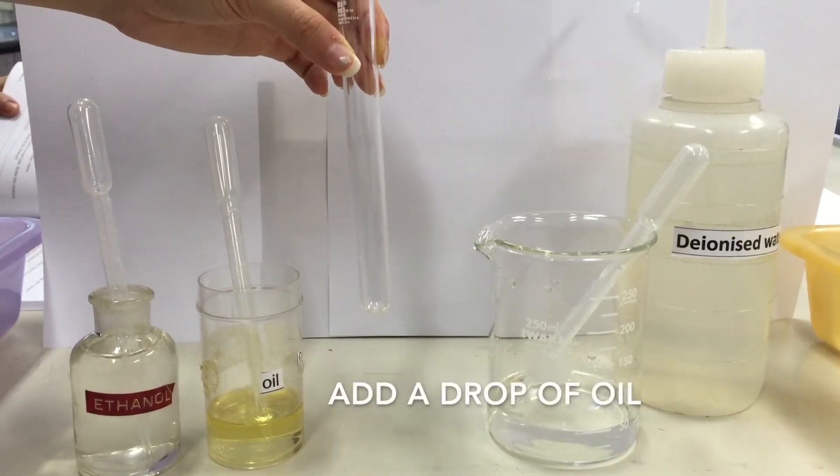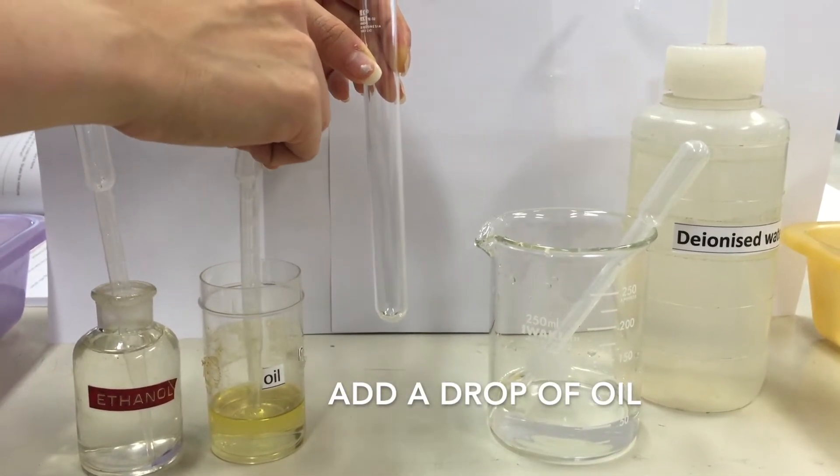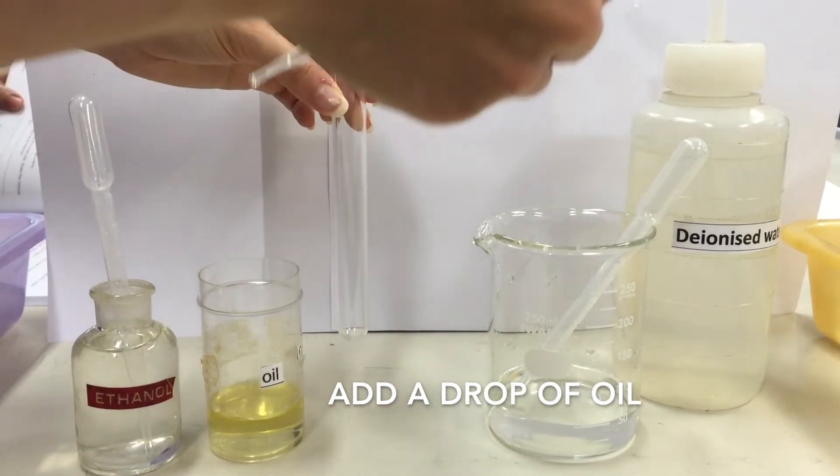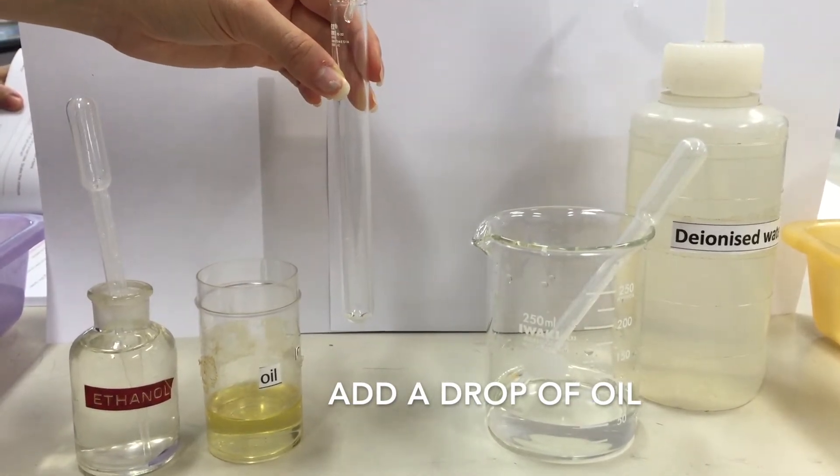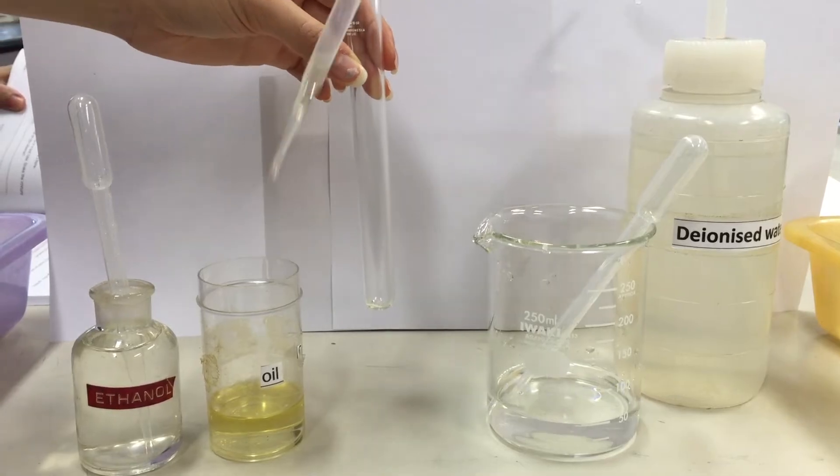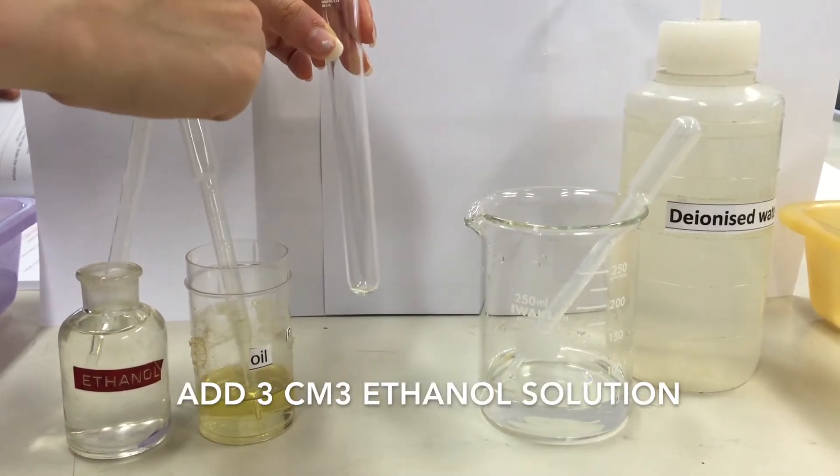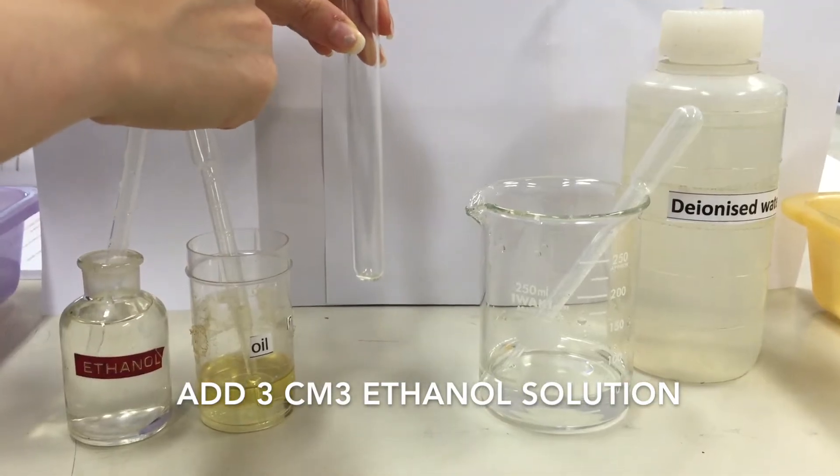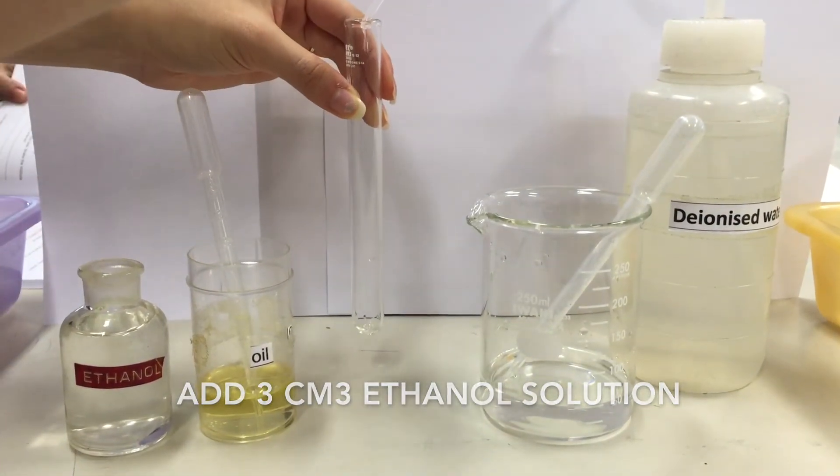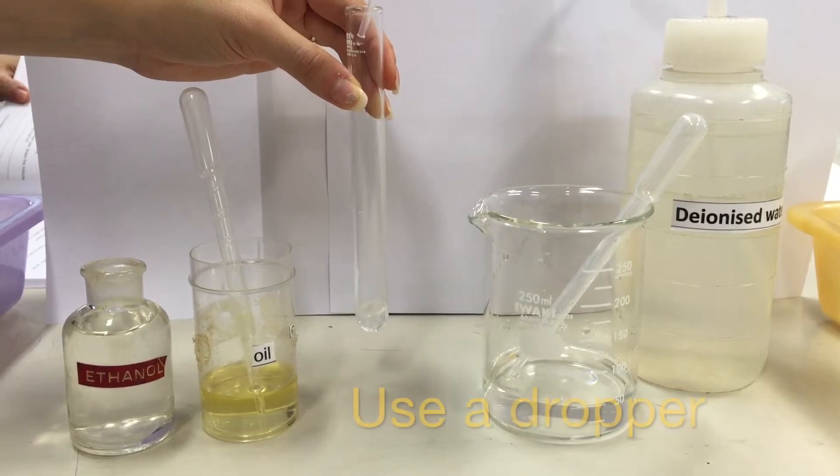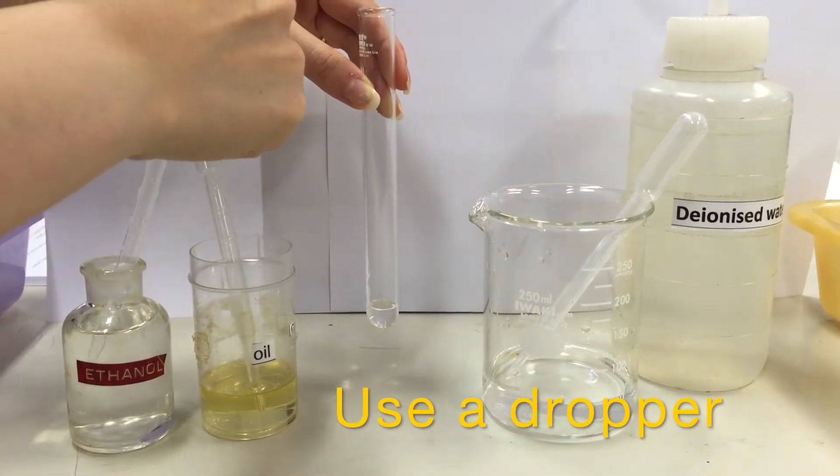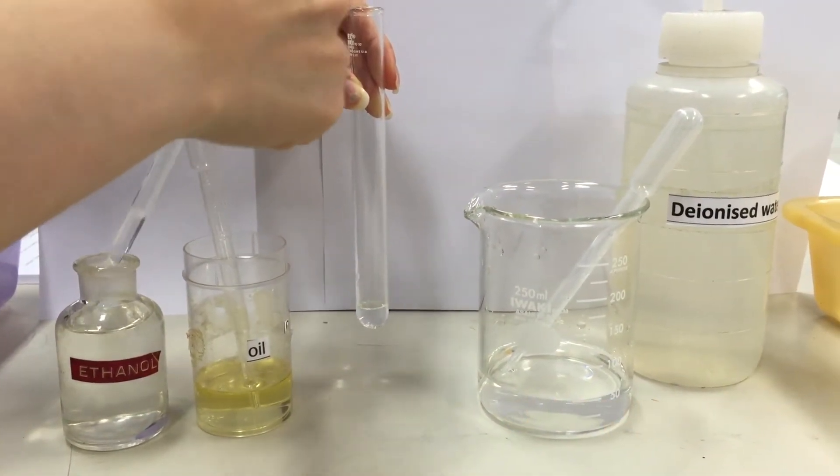We add a small drop of oil in a test tube. Next, we add 3 cm³ of alcohol to the oil in the test tube. We use a dropper to measure exactly 3 cm³ of alcohol.